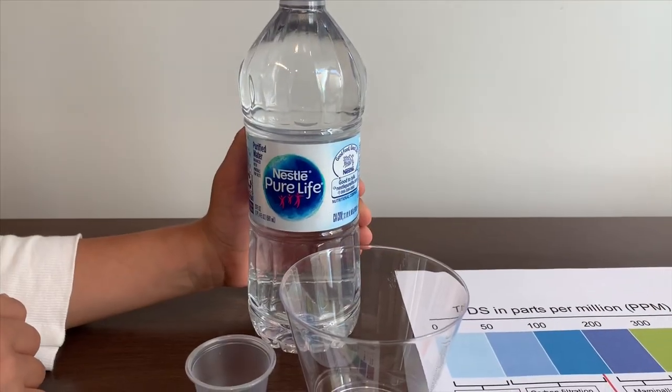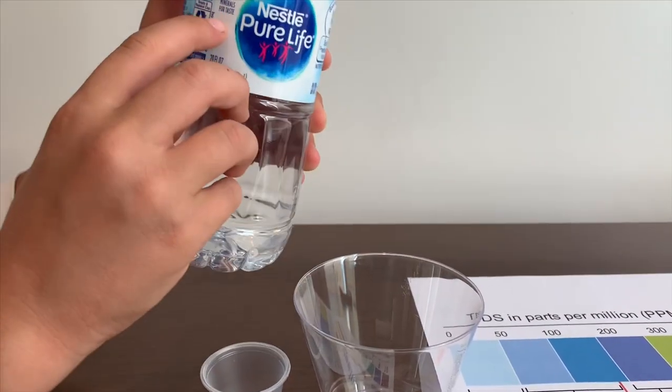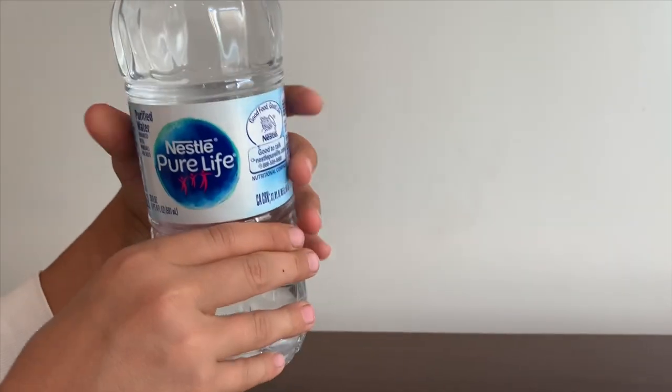This is a Nestlé Pure Life purified water, enhanced with minerals for a taste, and it costs one dollar.